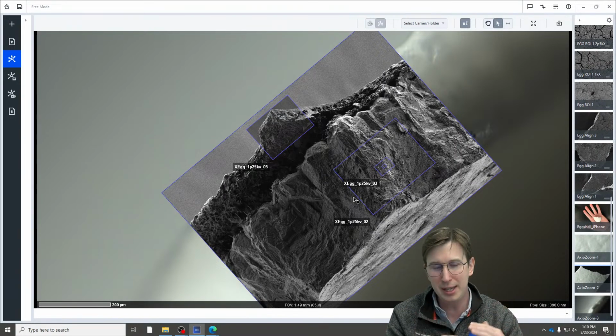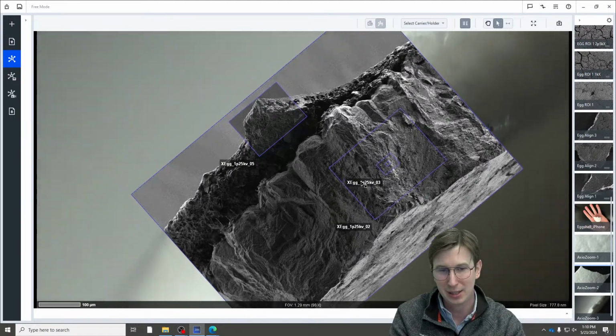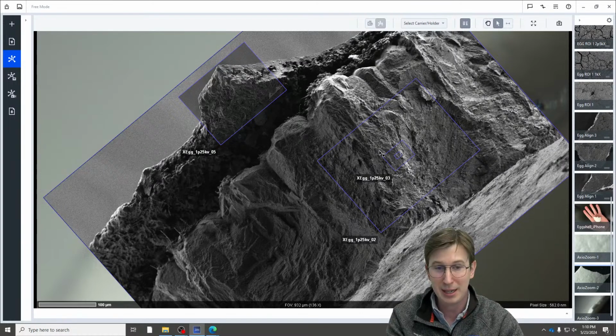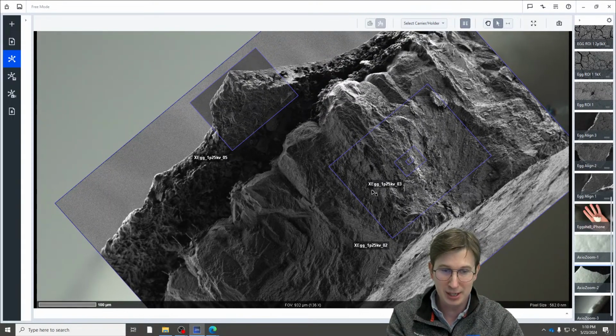So if you're doing this all-in-one imaging session, you just import your data. These images are automatically stacked and positioned. So for example, all of this data that I collected in the microscope was done in one session. And when I import it, these groups of data are all registered by itself. I'll show you in a little bit how we can get it registered in a larger image. But let's take a look at this cross-section.